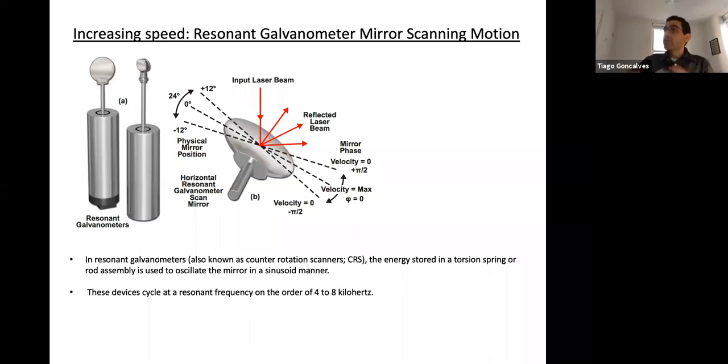So you actually have these very fast electro-optical modulators. And this is just polarization based. It's a set of crystals that select for polarization, and they basically divert the laser into a different direction and out of your microscope. But they're activated by a voltage. So they can be synced with the sine wave, so whenever the sine wave reaches a certain level, this thing triggers a voltage and it'll just blank out the laser. The laser will be going elsewhere, usually into a beam dump. Okay, cool.